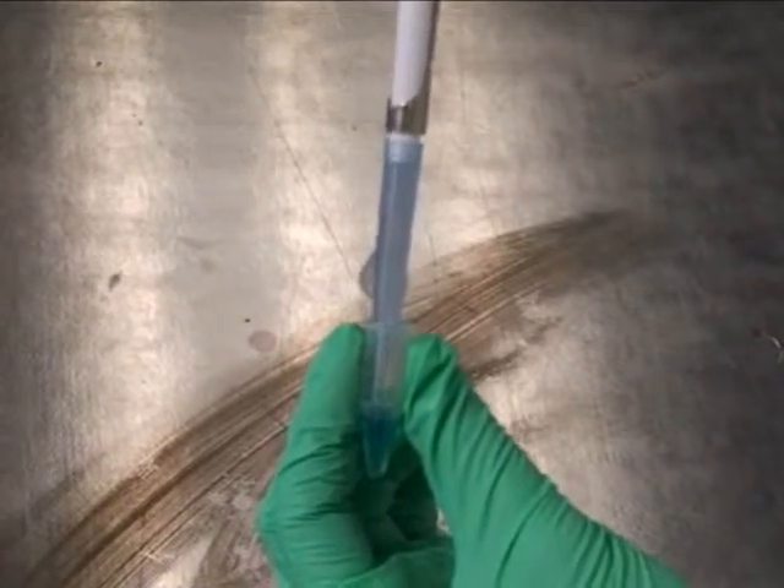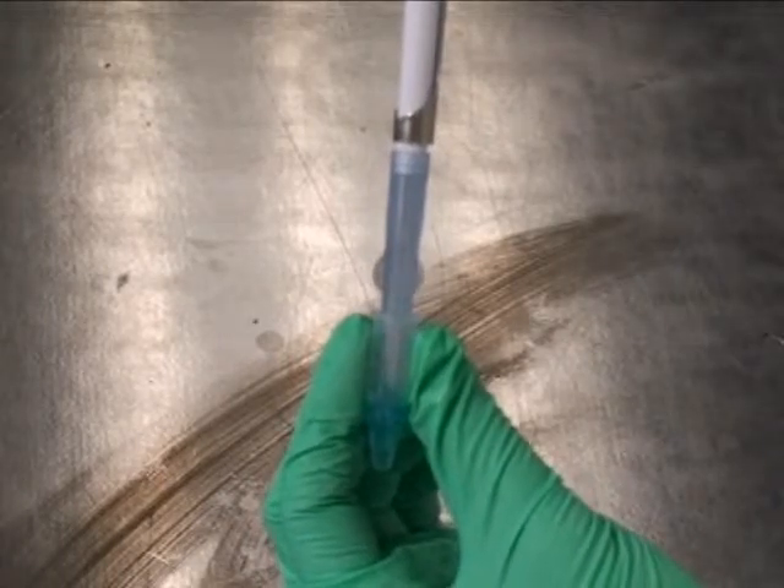Don't push the plunger in the liquid before pipetting, because you'll make bubbles and get an inaccurate measurement.